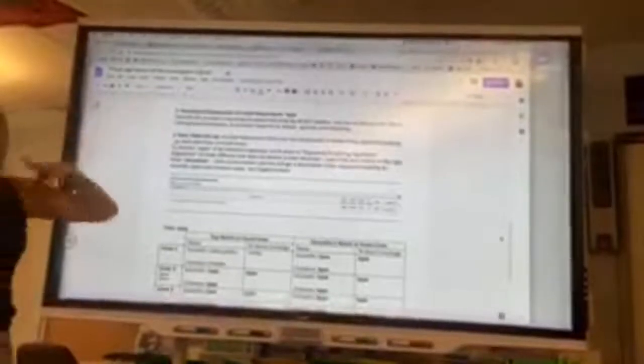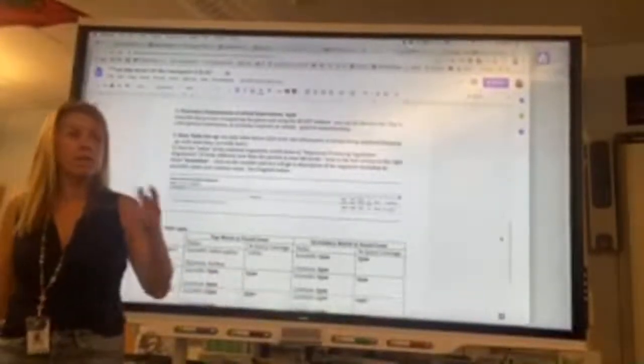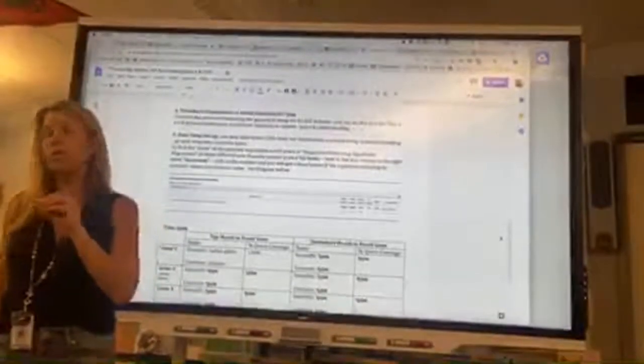Okay, so your flow chart would be something like go to the College Board website, download the genes, upload them into the BLAST lab, and then what instructions you had after that. That's what you need to have there.